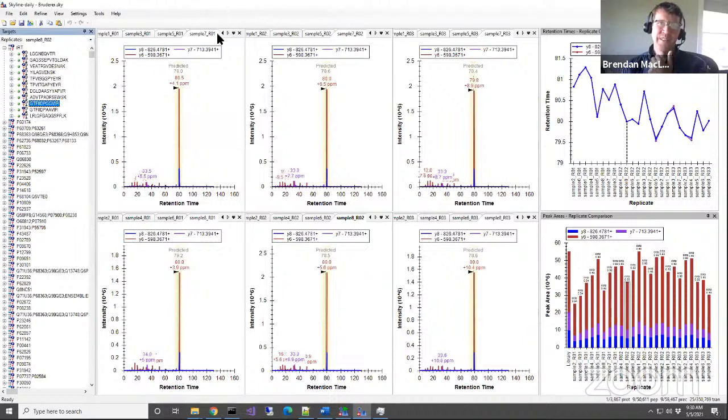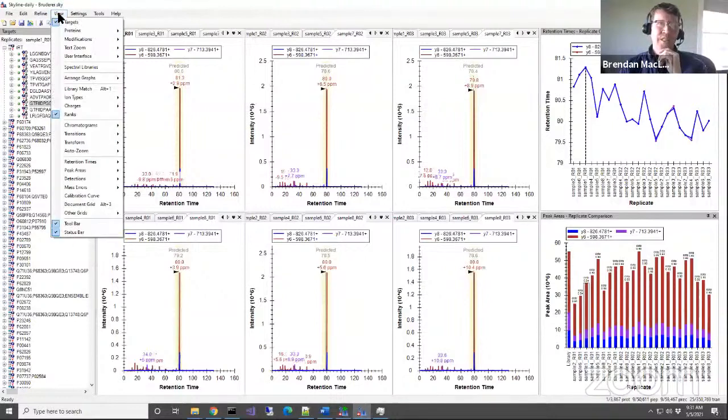This happens when people run OpenSwath and then import their data into Skyline. Even when we make it so that Skyline chooses exactly the same peak that OpenSwath chose, people say it's making mistakes. Well, they're all making mistakes. We're just going to treat that as noise. And if we've done things like randomization, we can treat it as noise and use statistics to hopefully find signal in the noise.